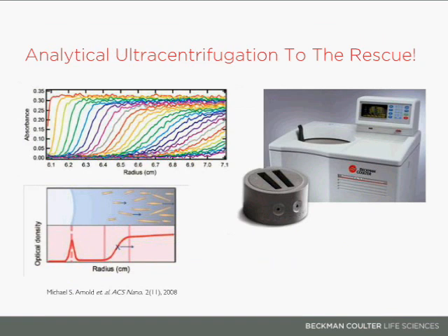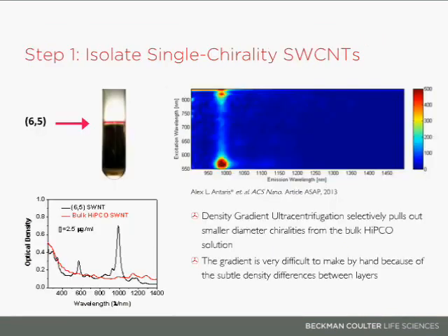You don't want to overtax it, so to speak. When there's 20 or 30 heterogeneous carbon nanotube species based on their wrapping scheme that all have different lengths and possibly different surfactant coverage, that's just too many variables to isolate in one run. So what works best is to actually pull out one wrapping scheme of carbon nanotubes, which can be done with density gradient ultracentrifugation, among other methods. In this way, you see from the fluorescence plot in the top right or the absorption plot in the bottom left, a single wrapping species, a single chirality of carbon nanotubes, is isolated.